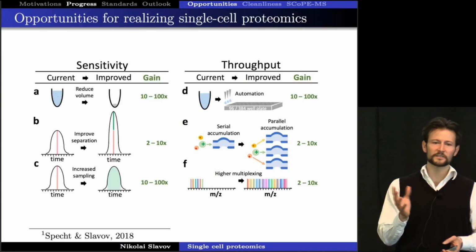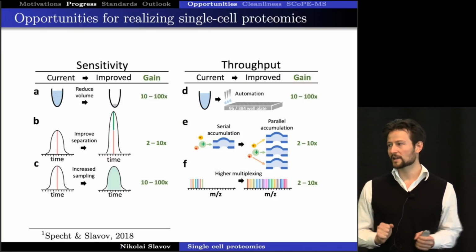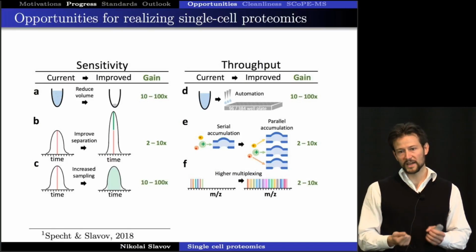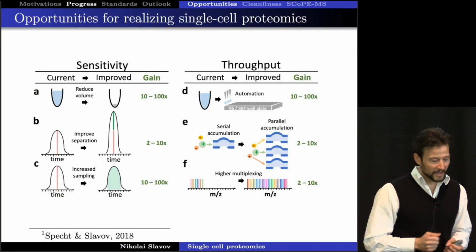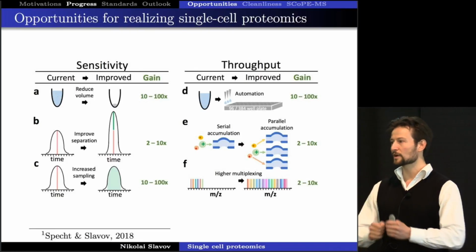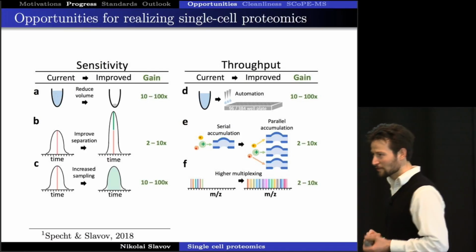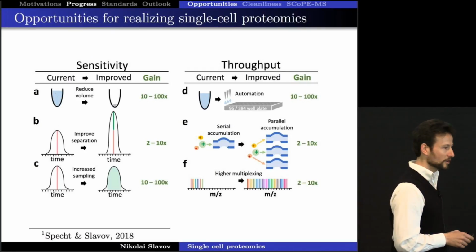Now, with transcriptomics, there is this unfortunate trade-off that it's easy to make a practically unlimited number of barcodes, but when you have a lot of barcodes, then the amount of data and quality of data that you get per cell decreases for the same number of sequence reads. In proteomics, that's not the case. If we could come up with 1,000 or 10,000 or 1,000,000 barcodes, the quality of data is not going to be affected. Well, maybe for 100 million we'll get into that range, but it's not going to be affected much more. But it's so much harder to make those barcodes.